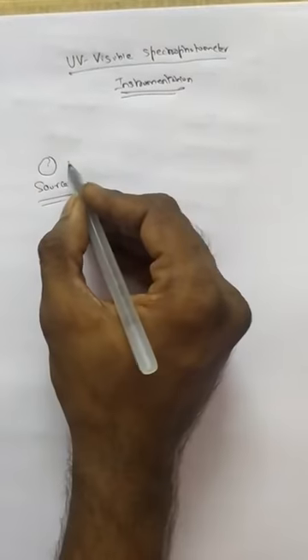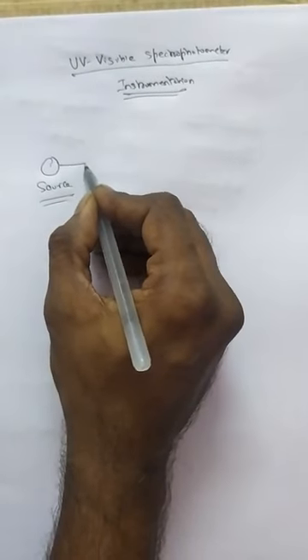A hydrogen or deuterium lamp will produce radiation from 200 to 400 nanometers.